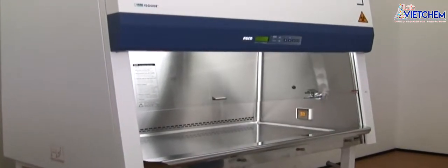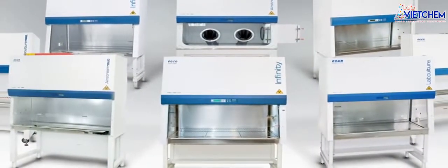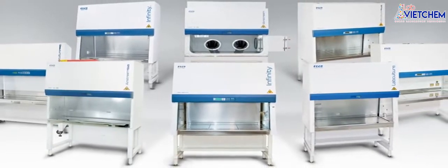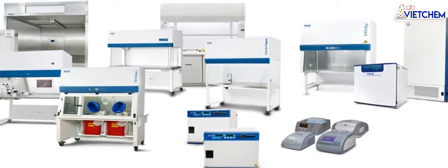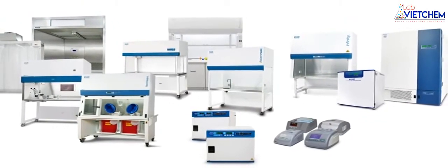Biological safety cabinets are classified into 3 classes. These classes and the types of BSCs within them are distinguished in 2 ways: the level of personnel and environmental protection provided, and the level of product protection provided. Proper working procedure while using a BSC is crucial, as it will affect the outcome of the work.